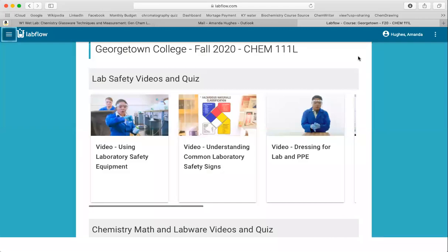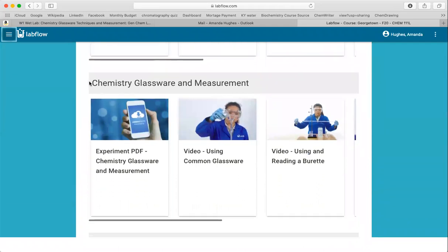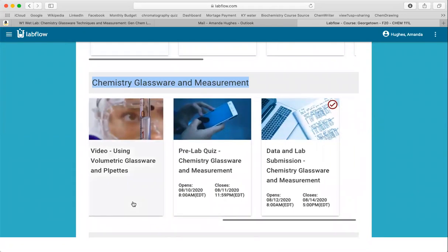So with this video, I'm going to show you how to submit your data for your lab report. You've just completed the very first lab and you're ready to submit. So log into LabFlow and scroll down to the very first experiment we completed, which was the chemistry glassware and measurement experiment. You can scroll through all the videos you've already watched and the pre-lab quiz you've already taken and click on Data and Lab Submission.